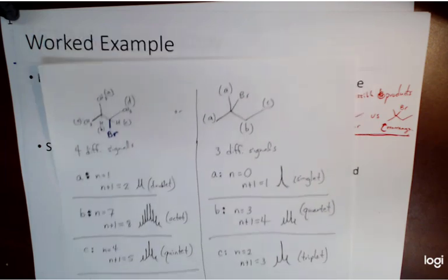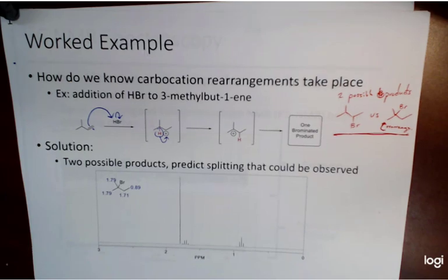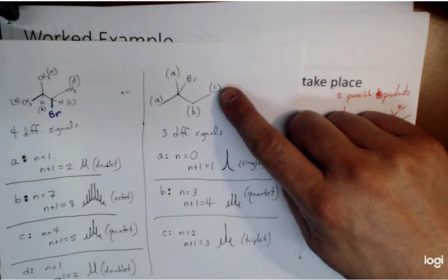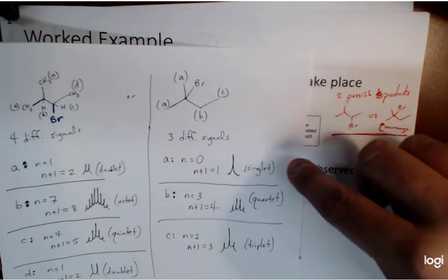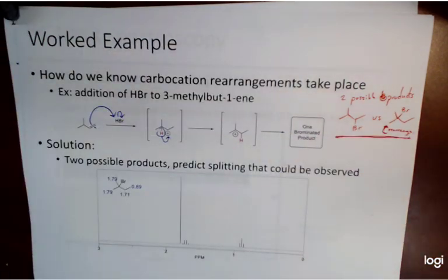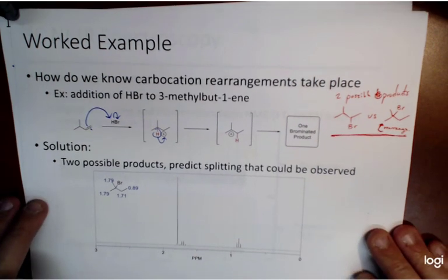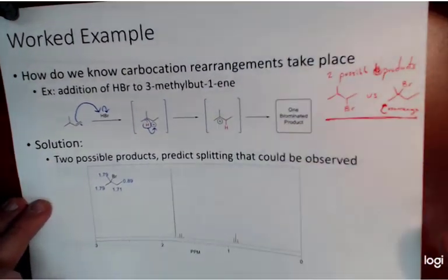So when we look at it, this would have been the product that we got. Based off of our estimate from before, we know rearrangements happen for carbocations, so we would see a singlet, quartet, triplet. Do we see a singlet, a quartet, and a triplet? We surely do. So just to let you know, we're not really making this stuff up when we show you these mechanisms, because we think it would be great to stress you out and give you some type of complex. We have experimental data like this to back up what we're hypothesizing and speculating in terms of a reaction.